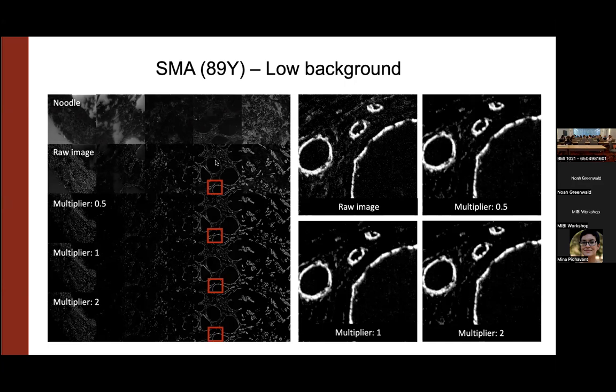The magnitude of all of those coefficients can go up or down, but the one thing we are pretty sure about at this point is that the proportions between them should be very consistent. The reason I wouldn't do that is that you should only have to increase or decrease the multiplier across the whole row.